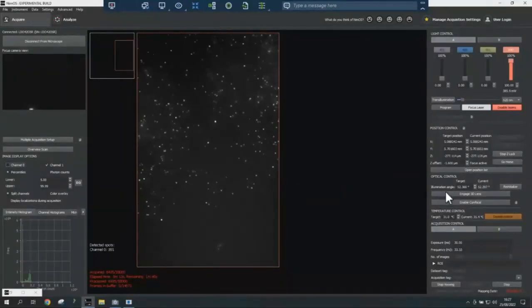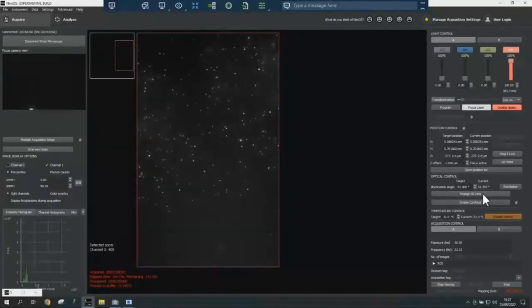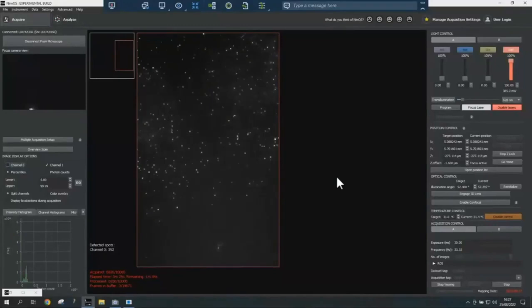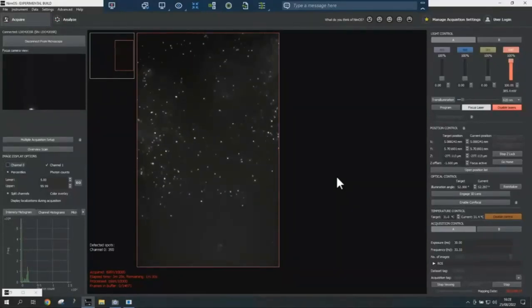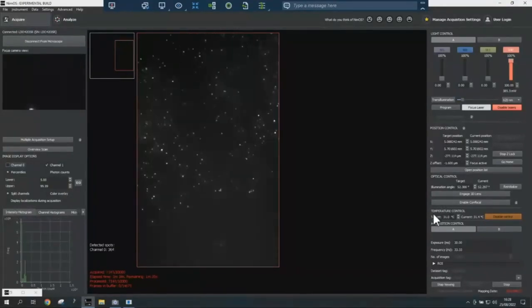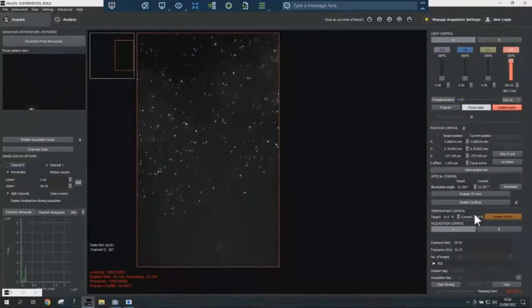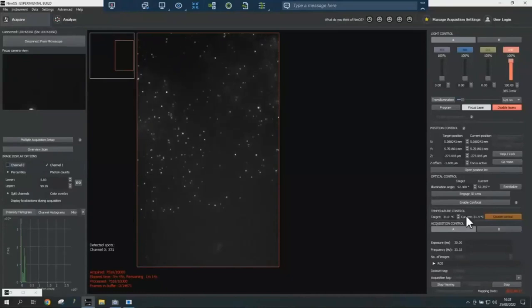We also have the possibility to do 3D STORM. Here we have an astigmatic lens that we put in the optical path, and this distorts the PSFs so that later, with the algorithm, we can have access to more planes of our sample. And again, like my colleague just said, we have the temperature control here. It can go up to 42 degrees, and if we want to do live cell imaging, we just turn this on, and the whole body of the Nanoimager will be warmed up.